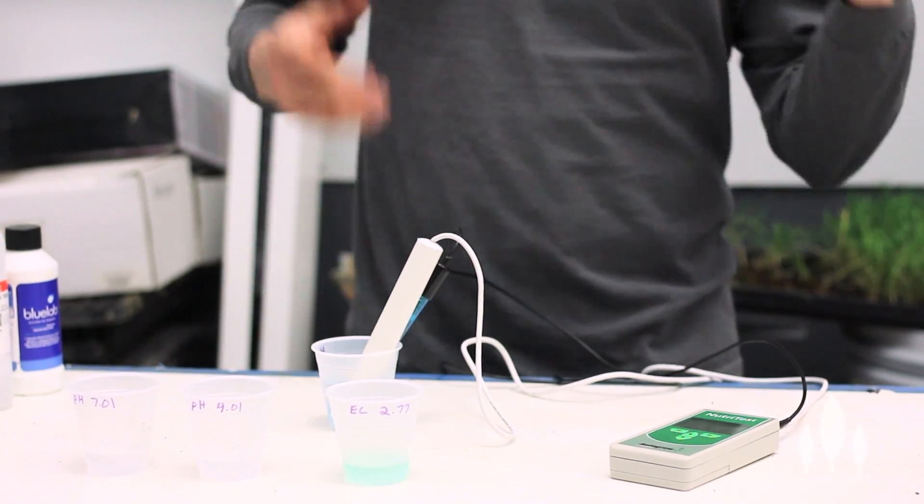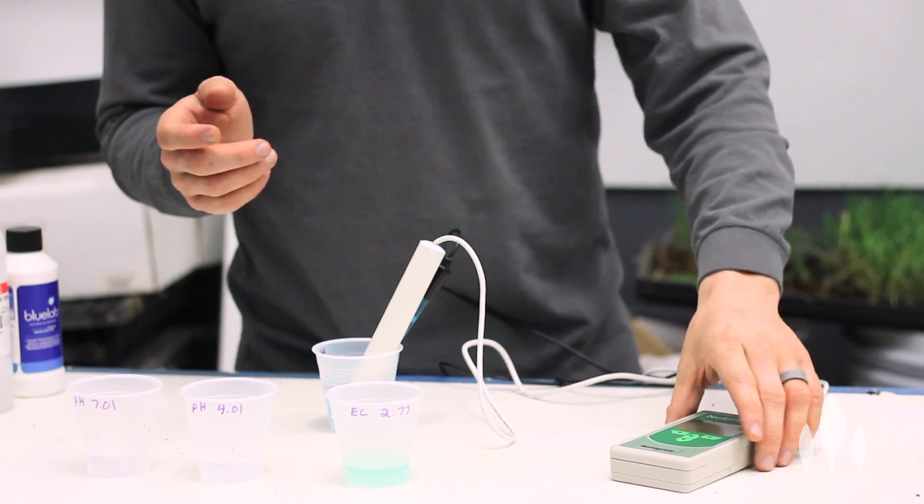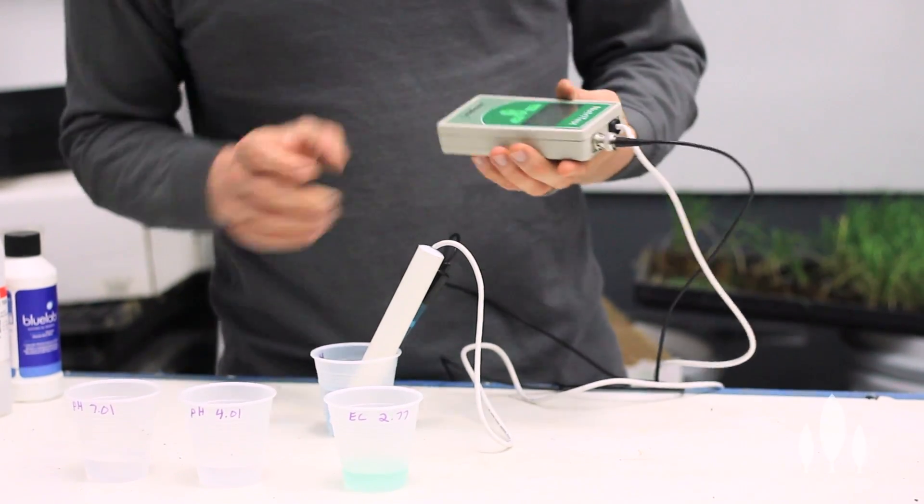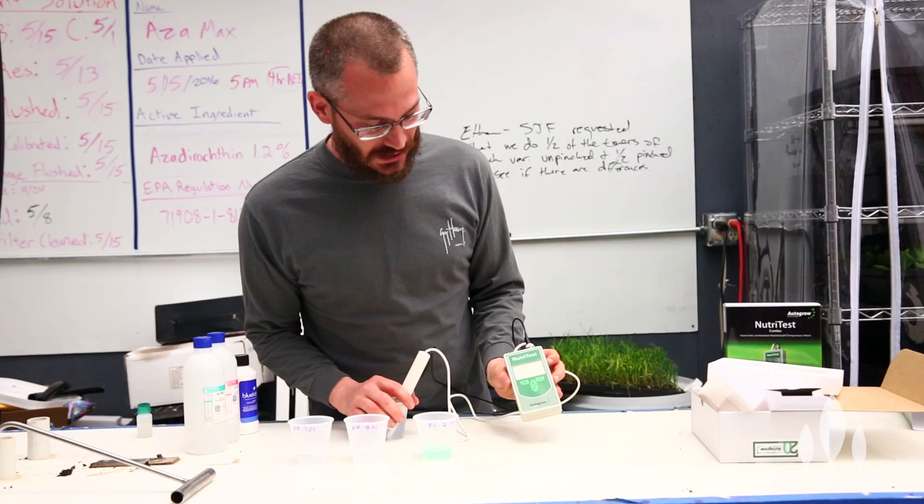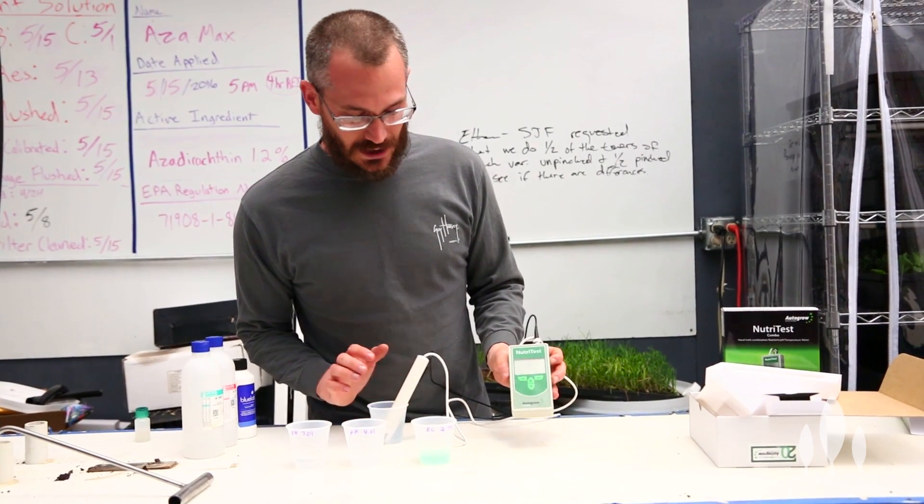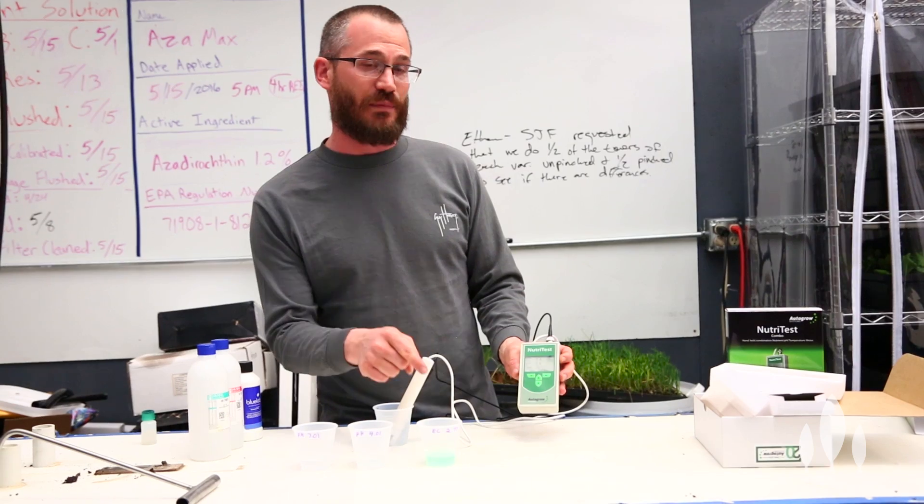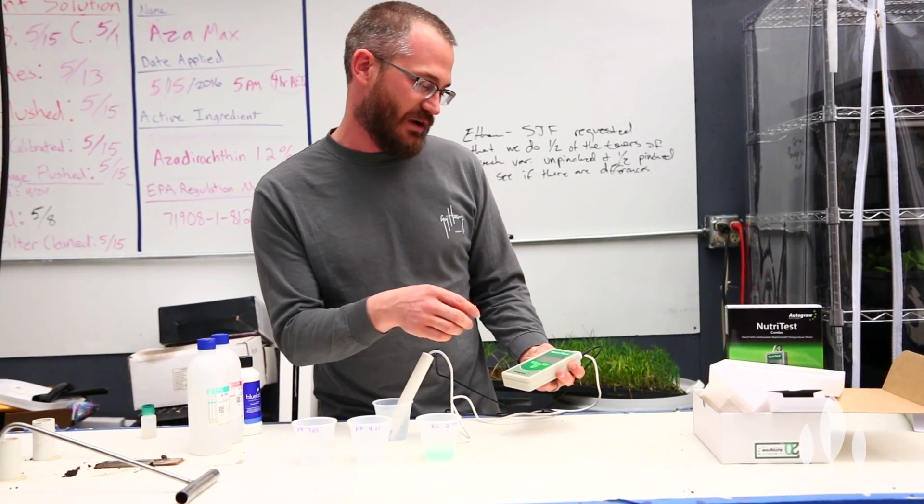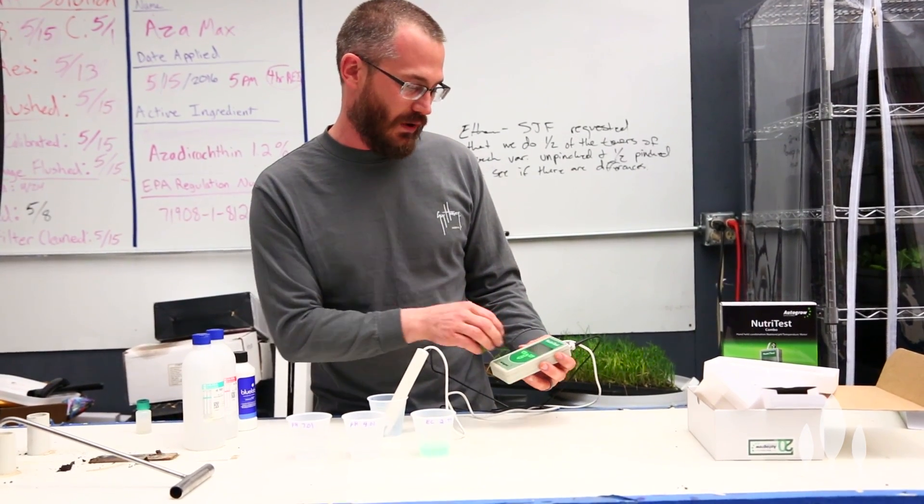And now, because they've come out of the box, theoretically, we have to calibrate it. So, to calibrate these things, you see it's already giving us measurements, temperature, EC, and pH. The first thing we're going to do is we're going to calibrate the EC. I know the EC meter is pretty much dead on right now, but we're going to do it anyway.